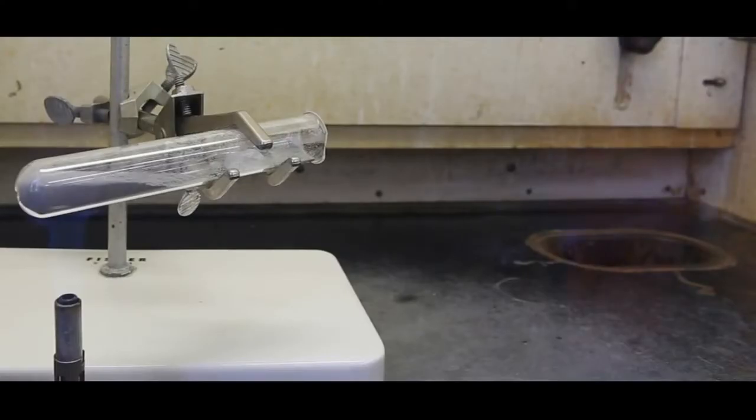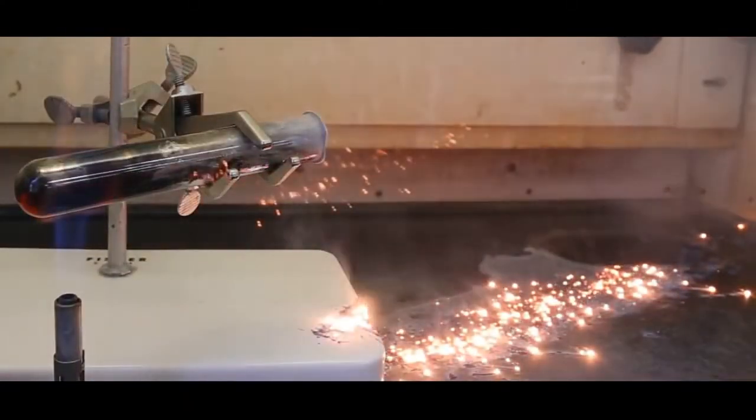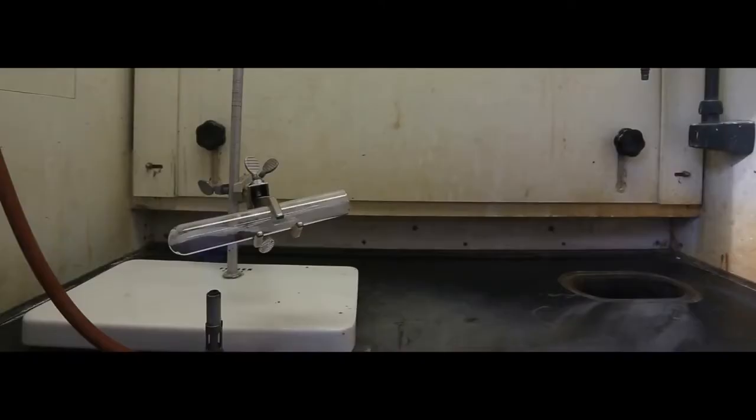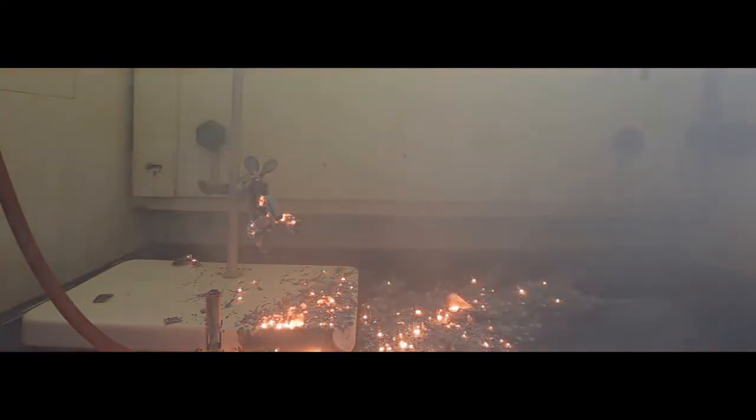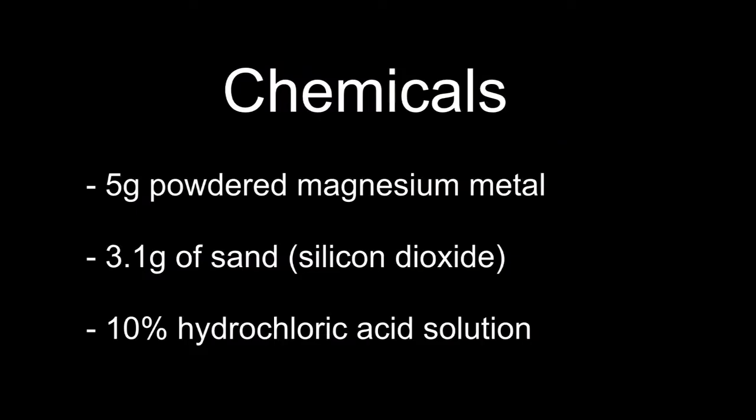Just as a side note, anything that spontaneously combusts in air under a temperature of about 54 degrees Celsius is known as a pyrophoric substance. For this experiment, you'll need 5 grams of powdered magnesium metal, 3.1 grams of sand, and at least a couple hundred milliliters of 10% hydrochloric acid solution.